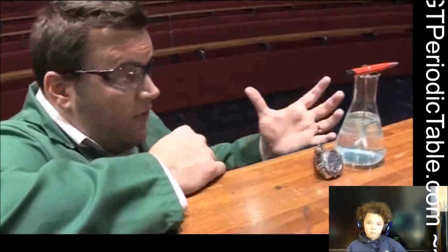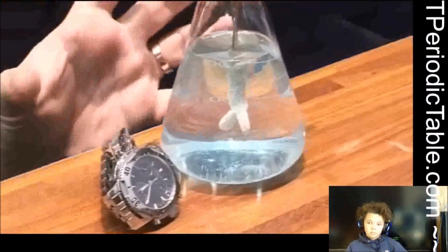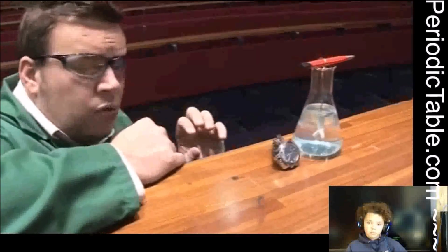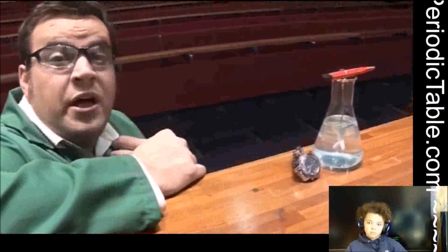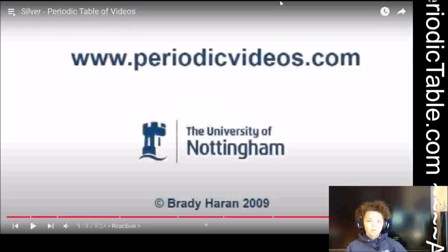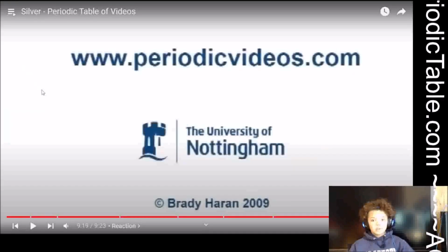So if you look carefully, you can see that the colour of the solution has changed. It was colourless. Now it's blue, which tells me that there's another ion, copper, in solution. Well, that's silver.